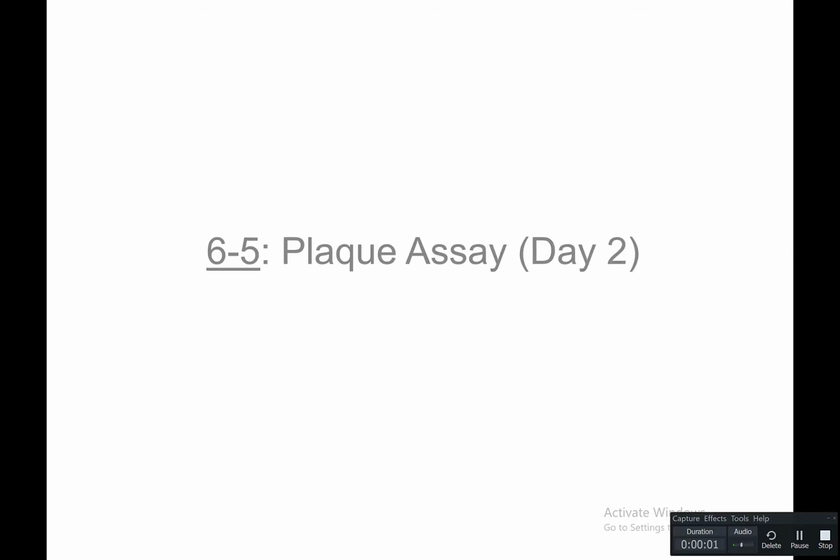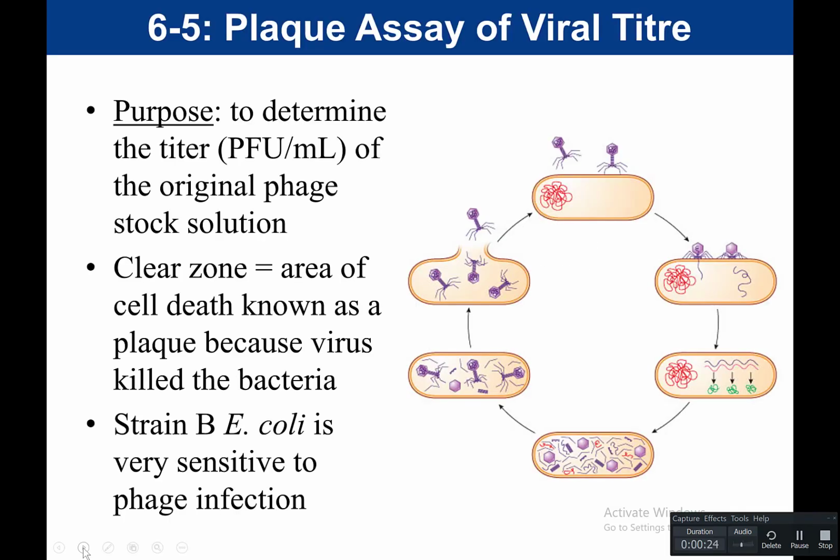So this is day 2 of the plaque assay, and in this day we're going to do the readout. So when we do our plaque assay, again, the purpose is to determine the titer, and our units for titer are going to be PFUs per milliliter. PFU stands for plaque forming unit. We'll talk about what that means in a minute. So our purpose is to determine the titer of an original phage stock solution.